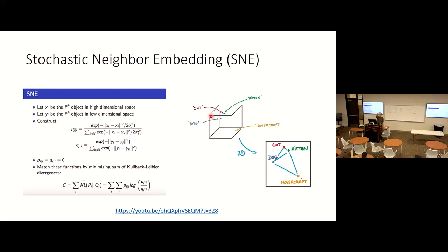If these 2 points are 2 cells, for example, in the high dimensional space, we don't care how high they are, how many genes you use to define these 2 cells. Relatively they are likely to be neighbors to each other. Then I want to reflect this relationship in the 2D.